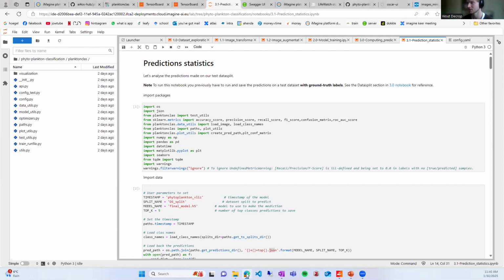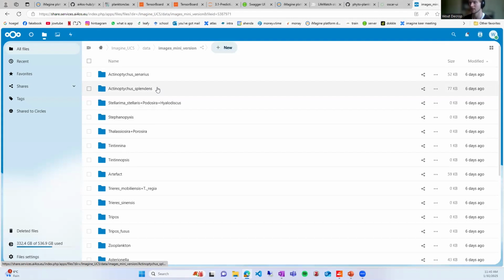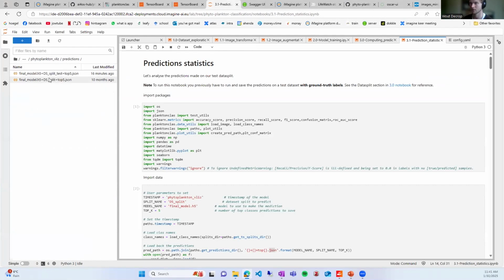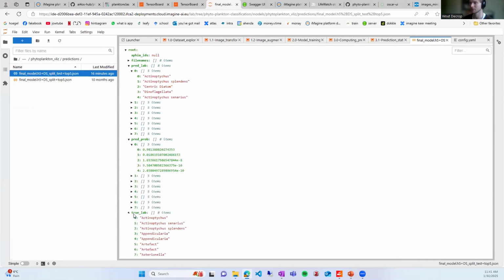So the correct prediction, if you are working with validated data, because we have our data folders on Nextcloud, we know what it is, because a human has already annotated these, we have our trained data set with labeled images. We can look at the prediction which the model made, so here I'll go to models, predictions. So we can look at the predictions that the model made and the confidence it has. And then we can look at the true labels, because we do know at the end, we have labeled images what it is. So we then have to look if they match or not. And then through these notebooks, you can see if the first one matches, or if it's not in there, if the model was wrong. So you have to manually see if the model is correct through these notebooks.